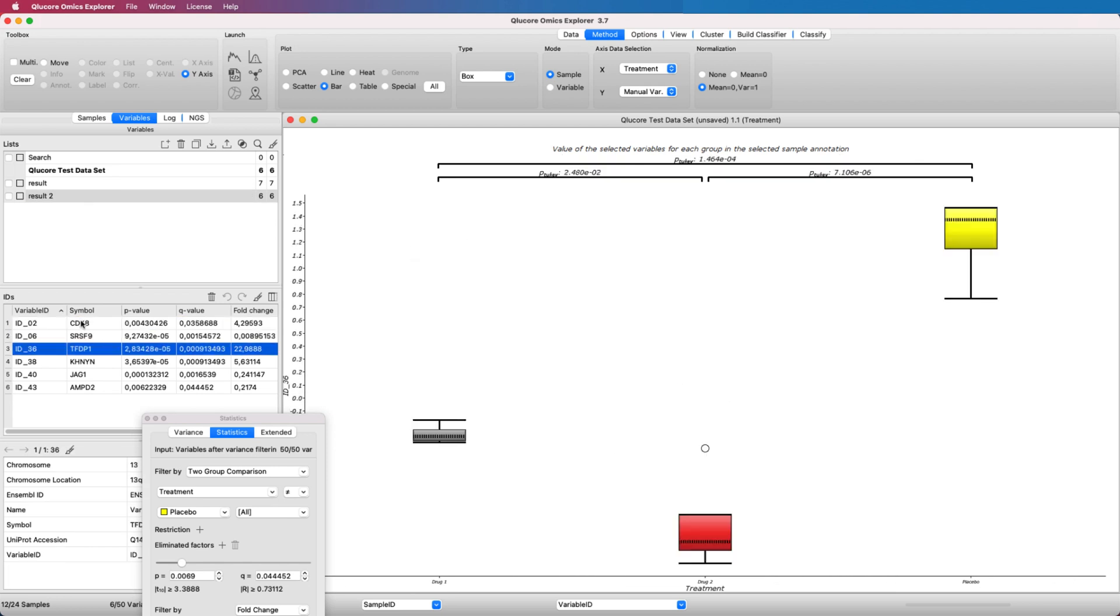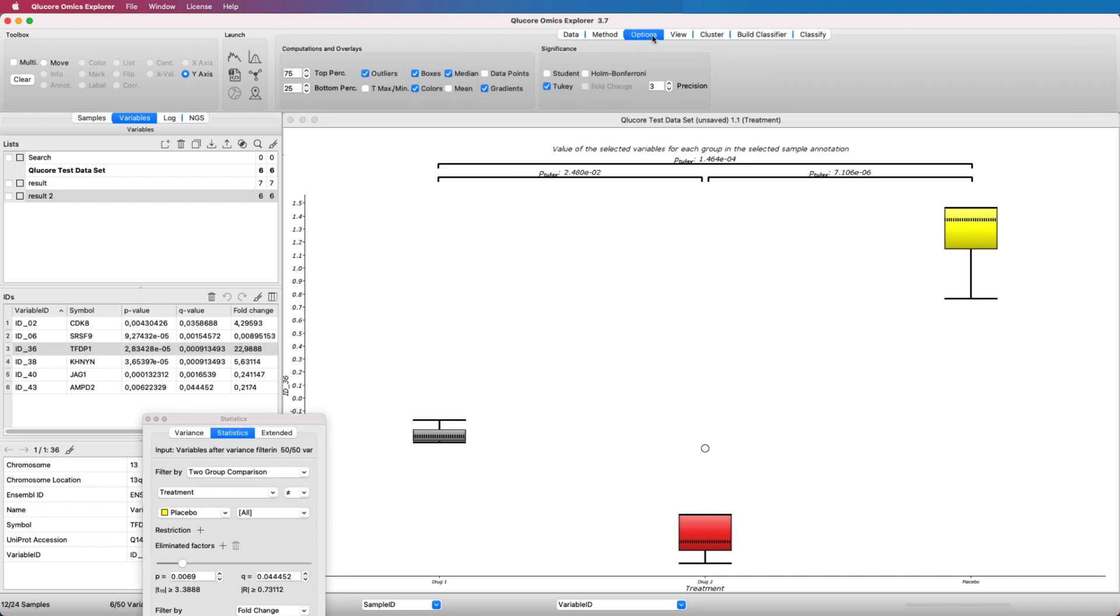There are more settings available in the Options tab. You can, for example, show p-values for post-hoc analysis such as Tukey, Bonferroni, and more.